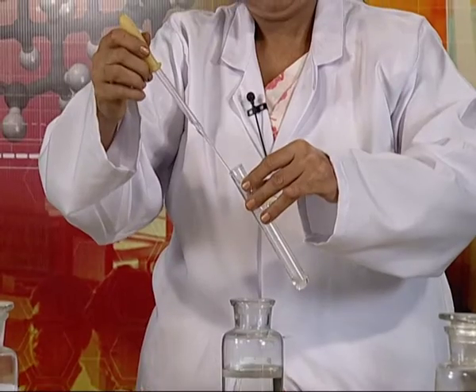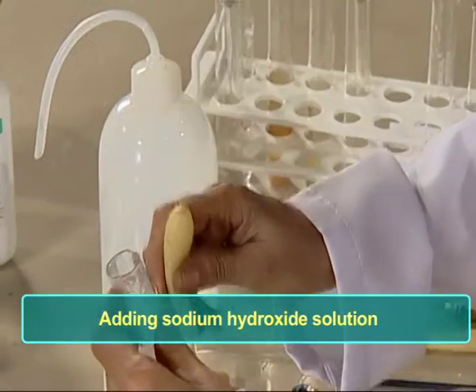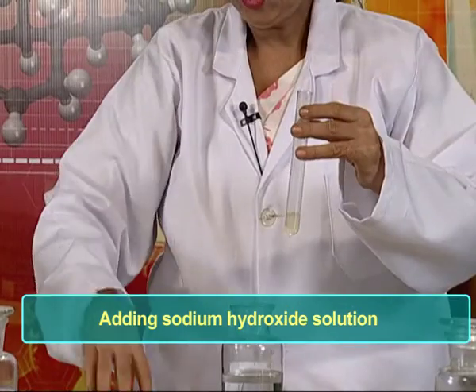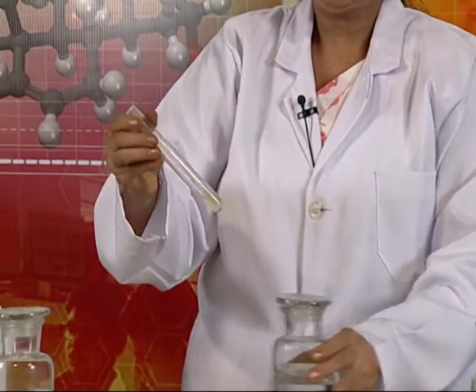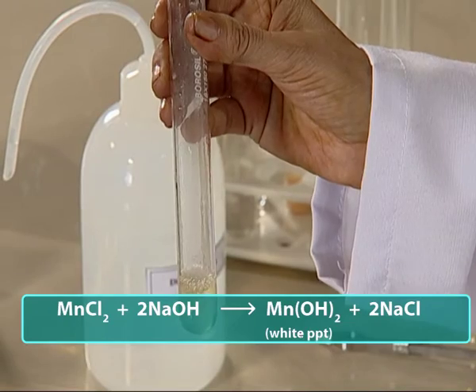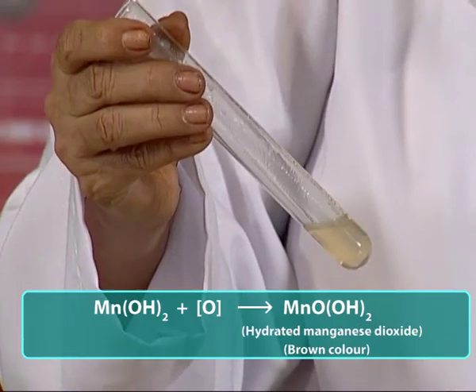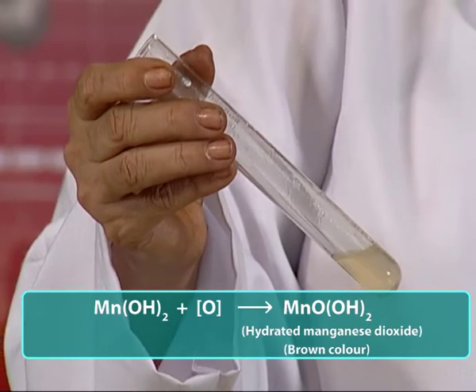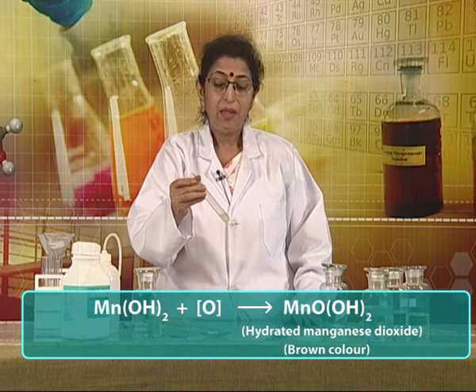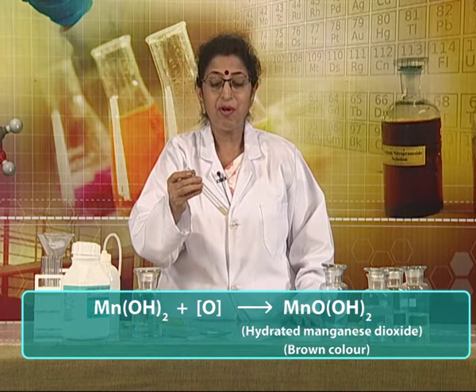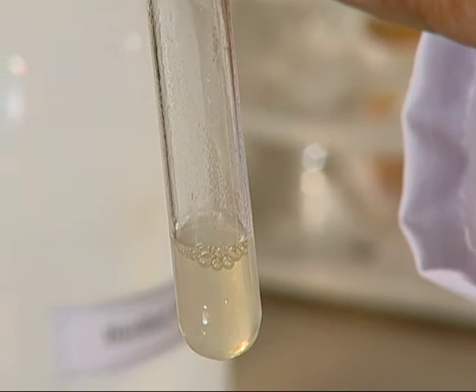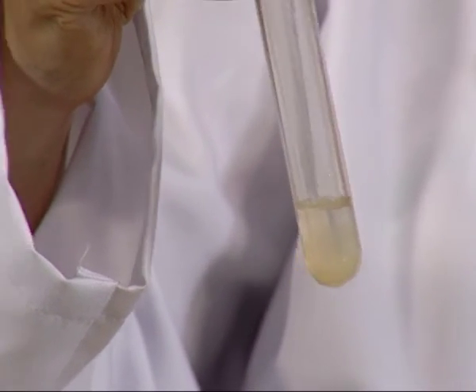In this solution, we add sodium hydroxide solution to see what happens. A white color precipitate appears because of the formation of manganese hydroxide. Due to atmospheric oxidation, this white precipitate rapidly converts into a brown precipitate, which is due to the formation of hydrated manganese oxide. This precipitate confirms the presence of manganese ions in the given salt.